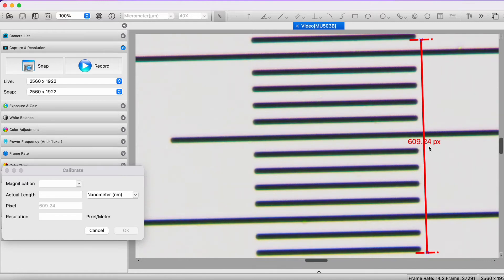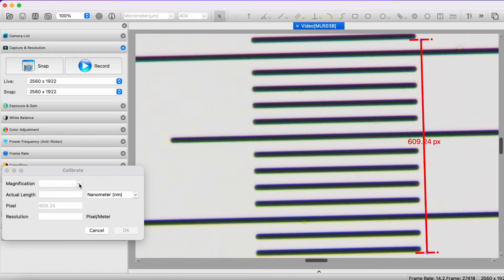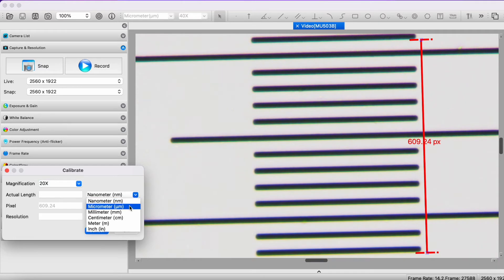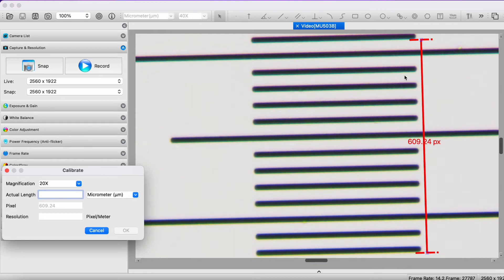I have a line of 609.24 pixels. Now I'm going over to the calibration window and I'm going to tell it what magnification I'm using — I'm using the 20x lens at the moment. It asks me to put in the actual length; I'm going to choose units of micrometers. I've counted 13 lines, so this line that I've drawn is 130 microns. I'll enter that in and click OK. And we are calibrated.